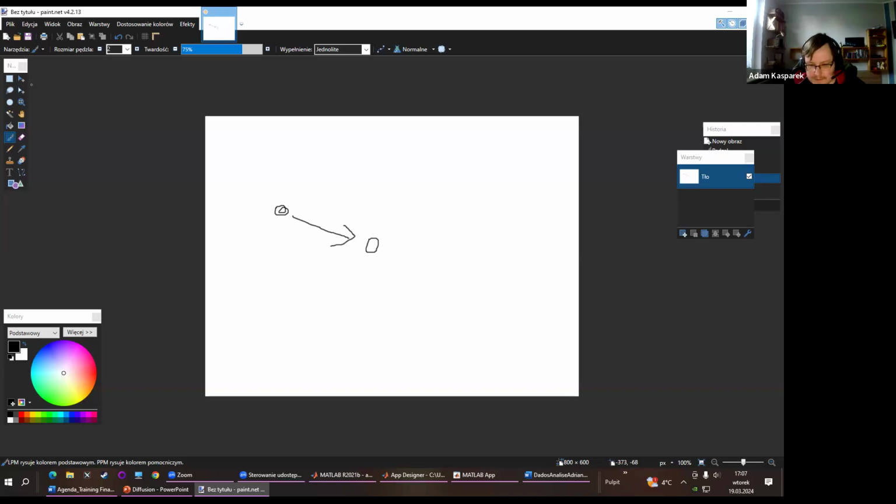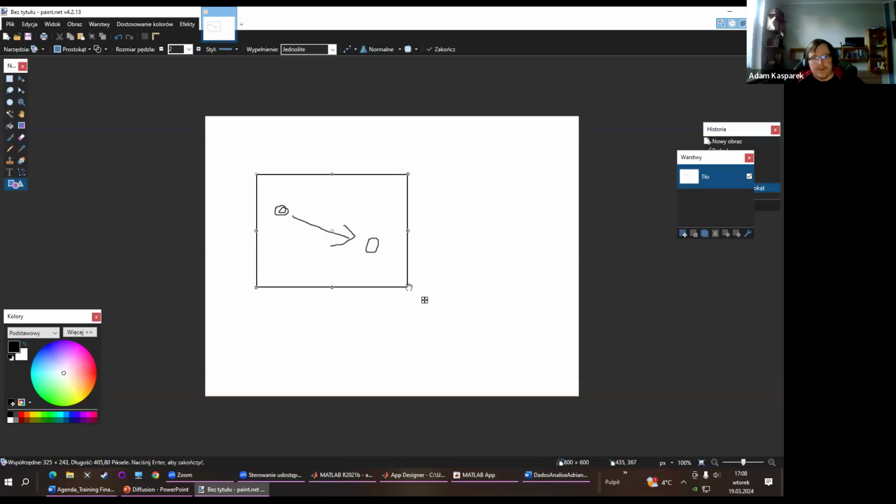Okay, what I want to say. We expect that these results go here, but the problem is that at the beginning we set, let's say, the bounds for our system, but the program doesn't know that here we have the correct solution. It has to somehow get here.